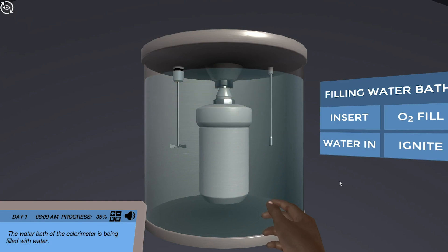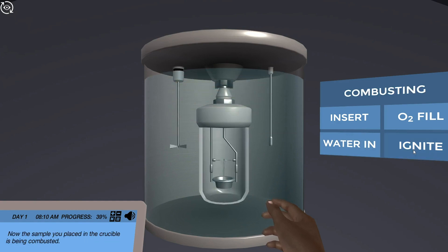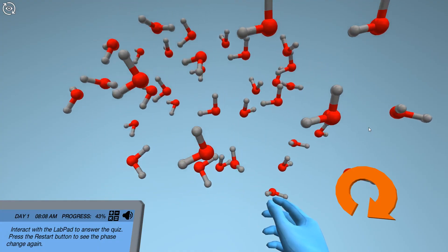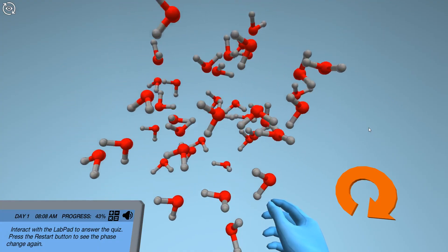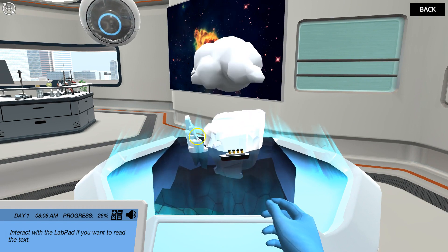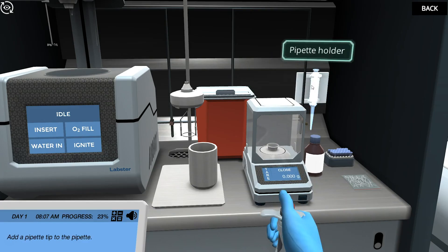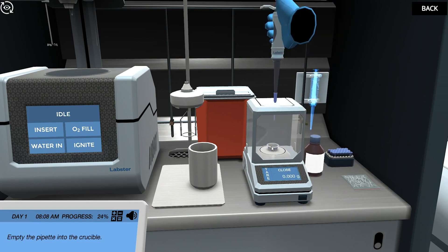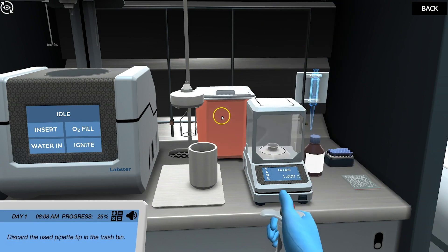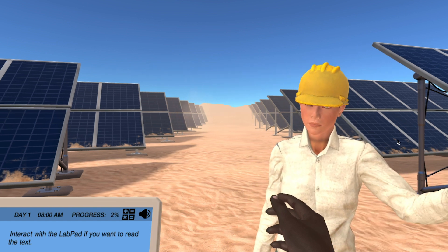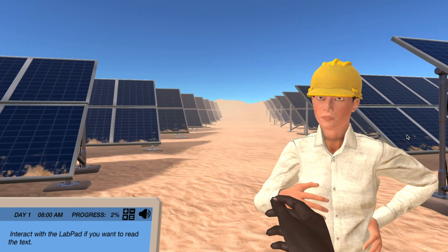Students are taken inside a calorimeter while it is running a combustion reaction. The chemistry package covers more than 30 learning objectives that are fully aligned with Chemistry 100 and Chemistry 101 courses. The simulations are designed so that students learn by doing in a virtual laboratory, solving real-case problems such as how to store energy from solar power plants.